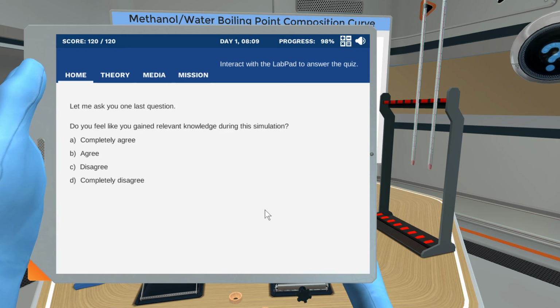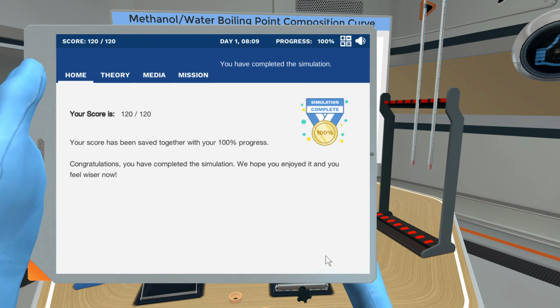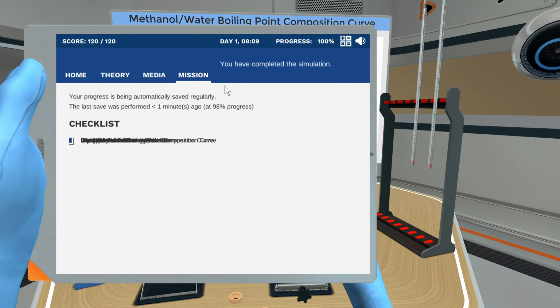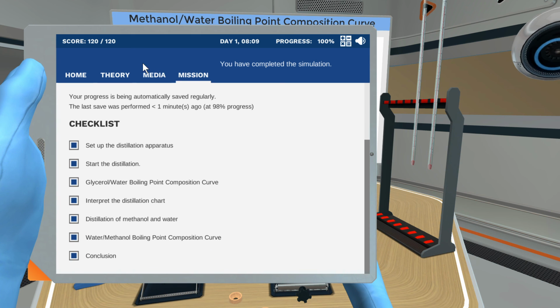Let me ask you one last question. Thank you for your feedback. Your score has been saved together with your 100% progress. Congratulations, you have completed the simulation. We hope you enjoyed it and you feel wiser now.